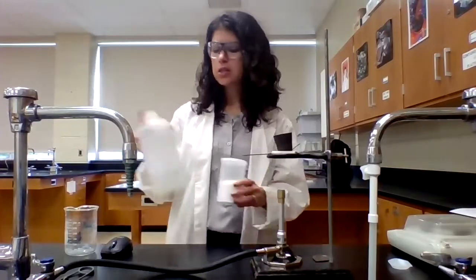But before I can actually start this reaction, I first need to take my crucible, which is what I'm going to be using to heat, and drive off any water that might be on the crucible. The thing with this lab is that we need to be very precise with our masses, and even a little bit of water that would increase our mass could mess up our results. And so the way that we drive off the water is we simply heat it up.